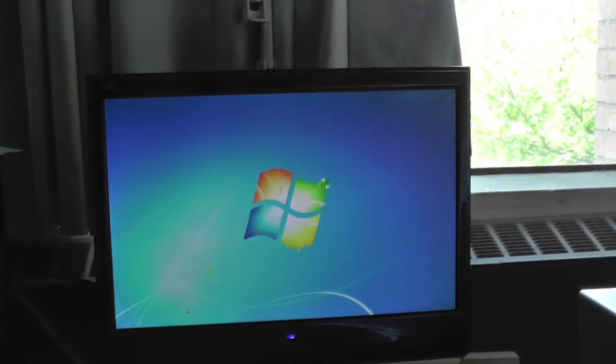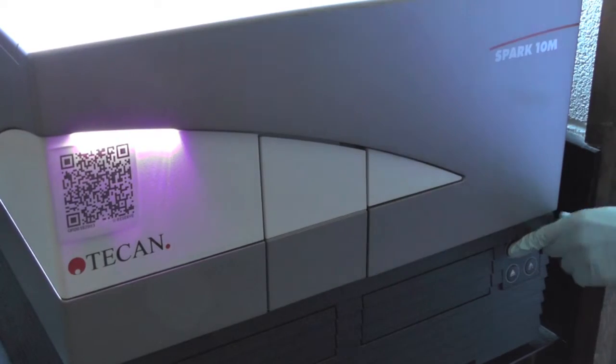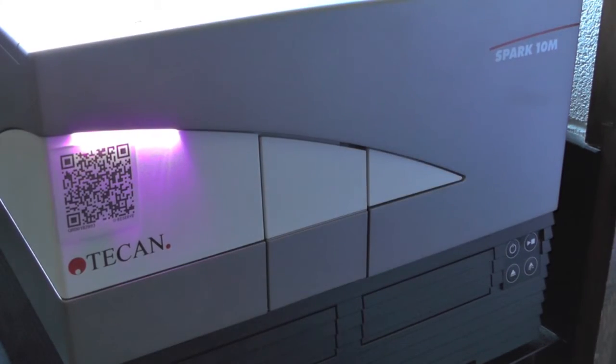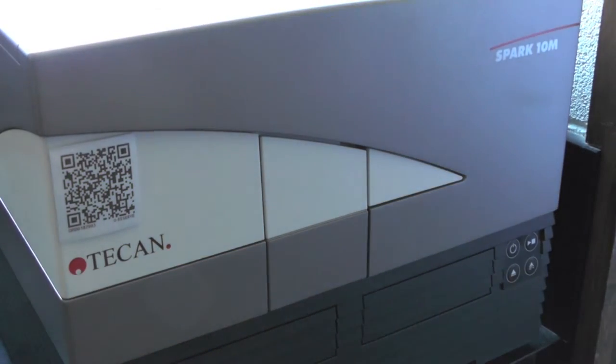When you are done with the Spectrophotometer, make sure you turn off the computer and power off the instrument from the front panel.